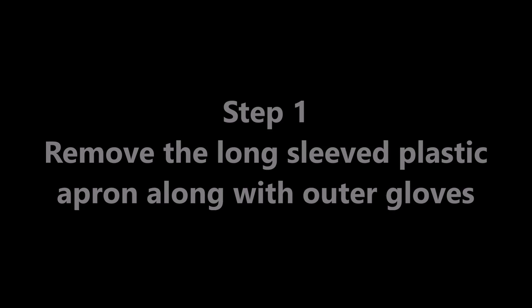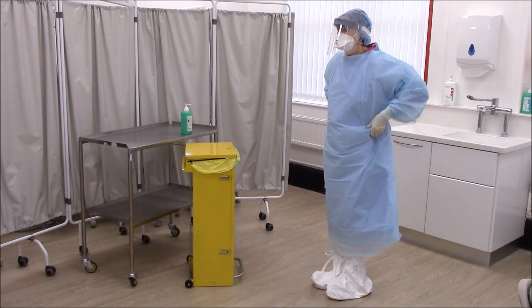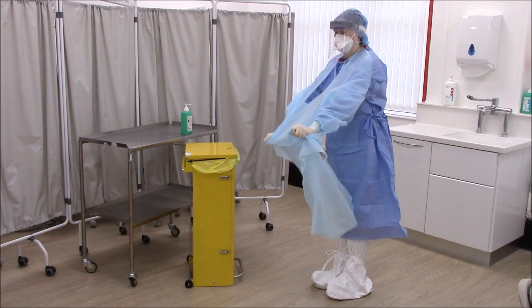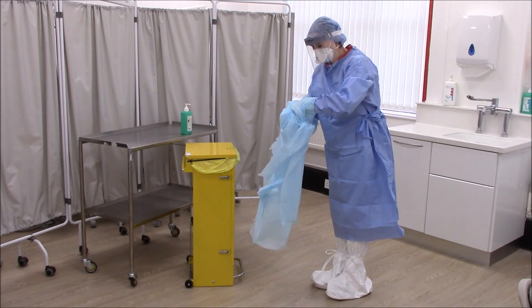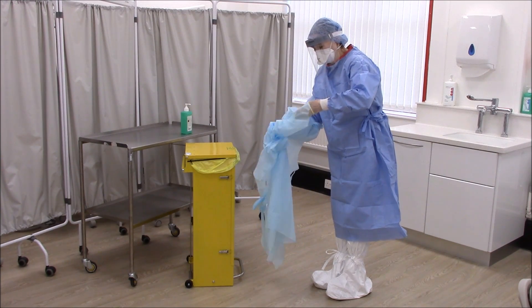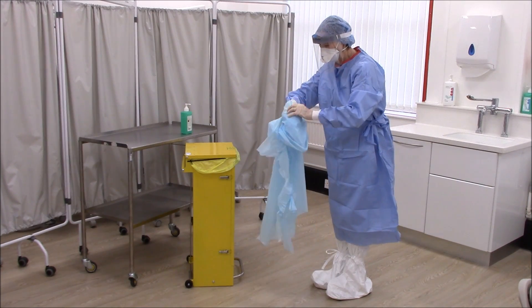Remove the long-sleeved plastic apron along with outer gloves. Break the ties and pull away from your waist, neck and shoulders. As you are removing your apron, also remove your outer gloves carefully one at a time, taking care not to contaminate inner gloves during the process. Fold or roll it into a bundle and discard the apron and gloves directly into the clinical waste bin.